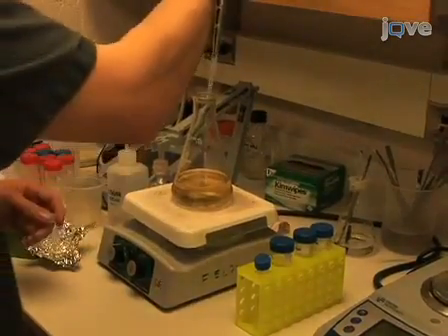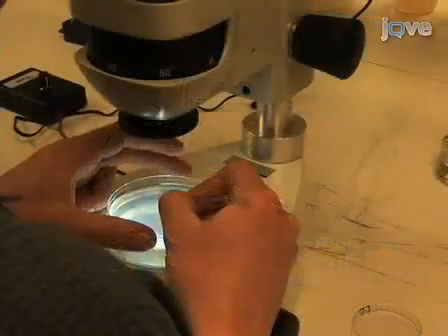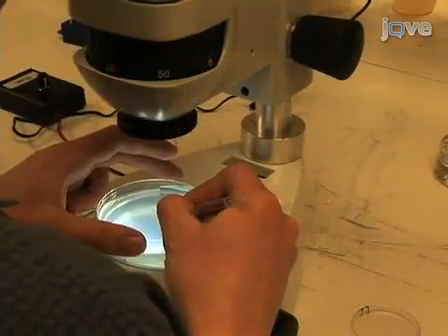I'm George Setson from the laboratory at MacTaberline in the Department of Pathology at the University of Washington. Today, we're going to show you how to measure lifespan in C. elegans. We use this procedure in our laboratory to study the genetics of aging, so let's get started.